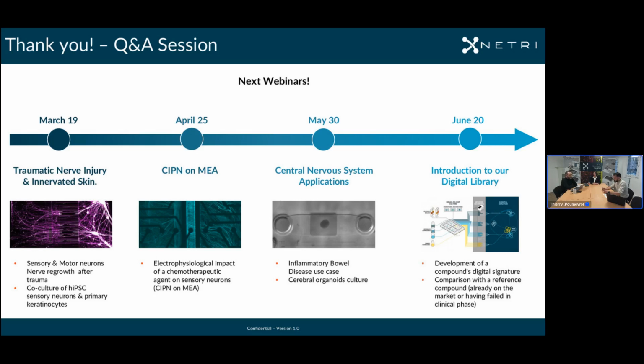Okay, thanks for that. So we're going to go on to the several questions. There is another question about whether you experimented with myelination evaluation with the DuaLink. That's question one. And within the question, there is also, is it possible to do co-culture of sensory neurons and Schwann cells, not myelin, with this organ-on-chip?